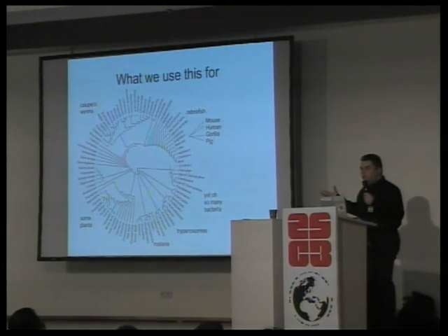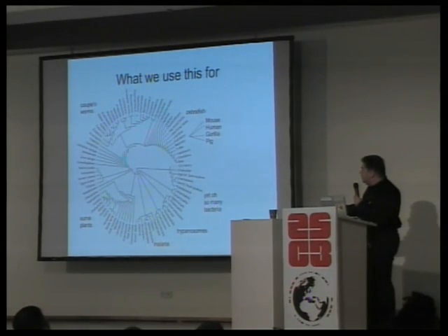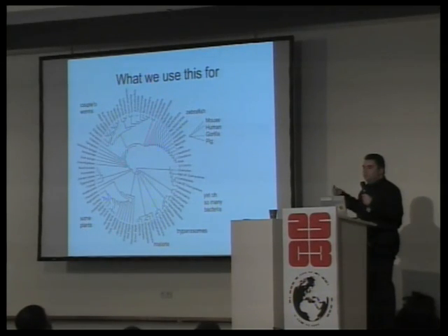Then we have a whole bucket of things that don't go anywhere, and there you can try and reassemble it, because they're probably new genes or genes that are so altered from the reference that they're not recognizable anymore. We have some worms, some plants, lots of bacteria. Fun thing is bacteria are so small you can probably bundle a few per lane.